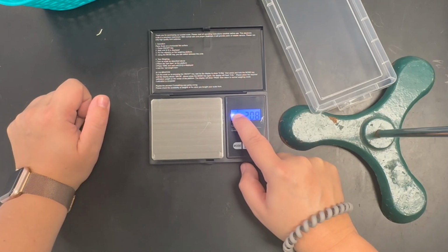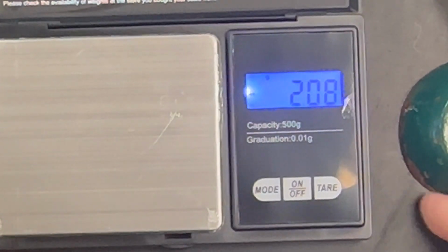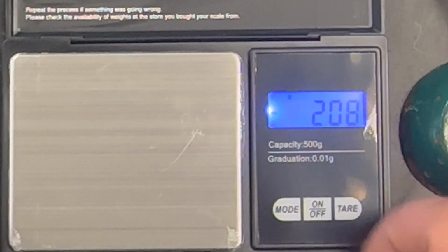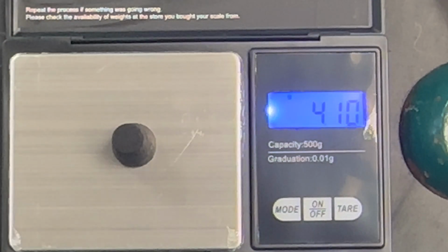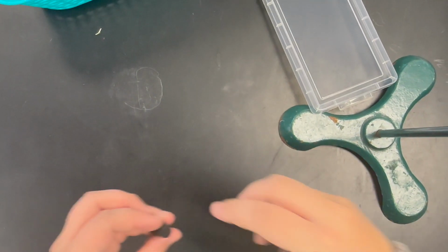First thing you want to do is double check the unit. It should say G for grams. If we zoom in there, G for grams. But right now you see it says negative 2.08 and there's nothing on it. So we're going to hit the tare button, which zeroes it. Once you place our rubber stopper on it, we get 4.10 grams, and we're going to write that down. Turn it off, just close it, put it off to the side.